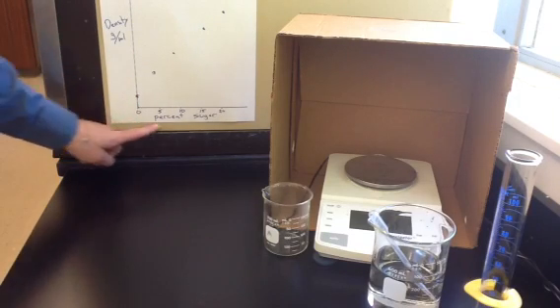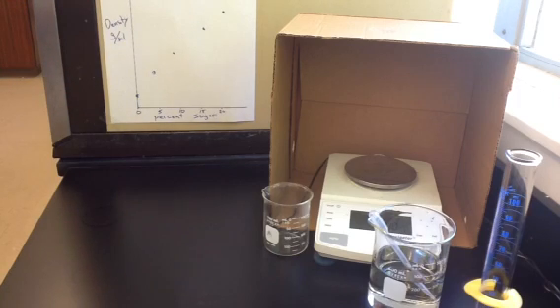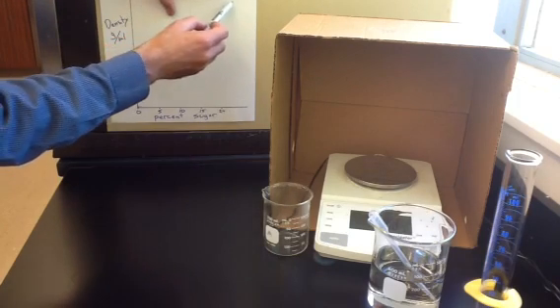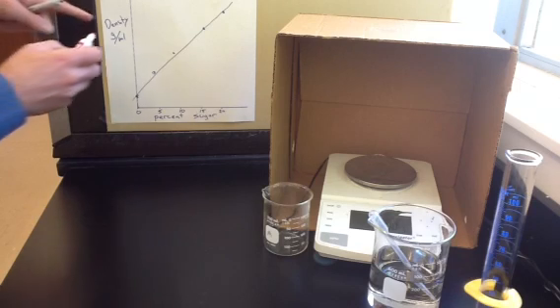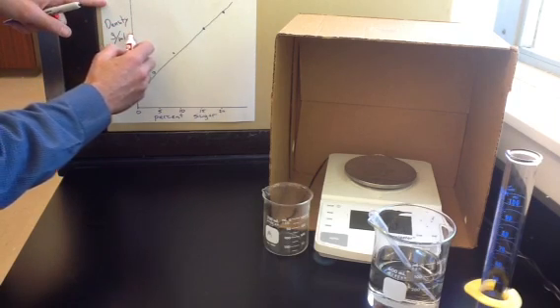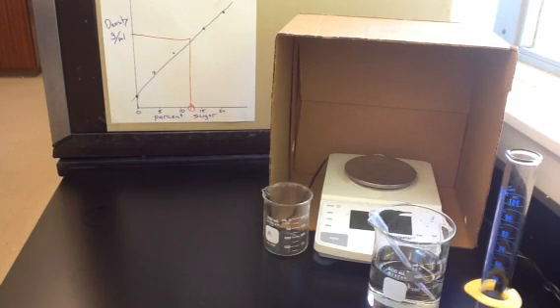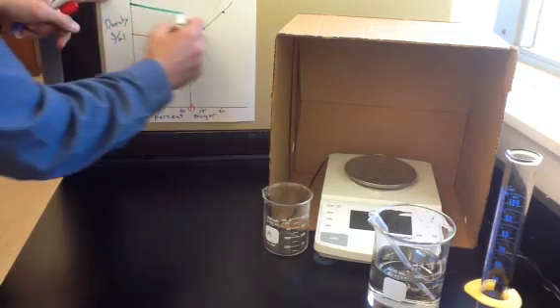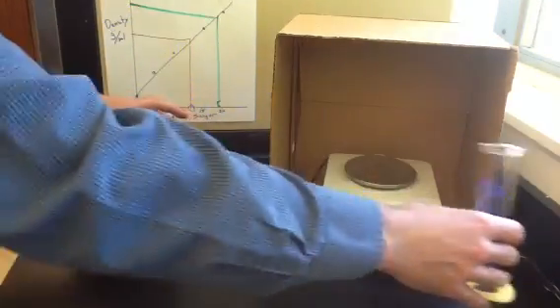You're going to make a graph with percent sugar on your x-axis and density on your y-axis. You'll plot the 5 points for the standard solutions, and then you'll draw a line of best fit, so a line that gets as close to those points as possible. Then you'll measure the density of the soft drinks, and you'll find their densities over here on the y-axis. You'll look over and you'll look down, and then that'll be an approximation of the sugar content of that particular drink. And you'll do that for 4 different drinks. So maybe one of the drinks is up here, and it has a higher sugar content.